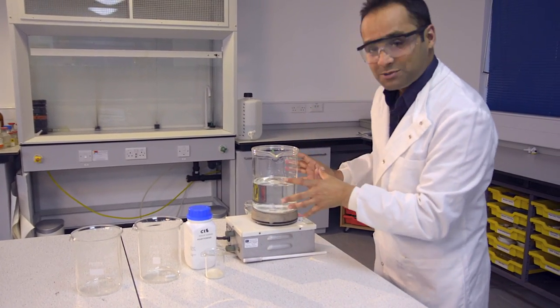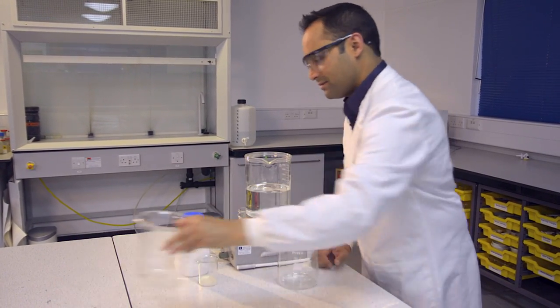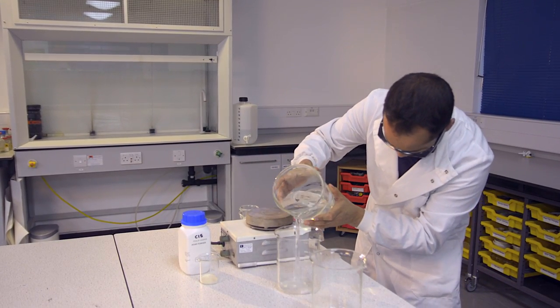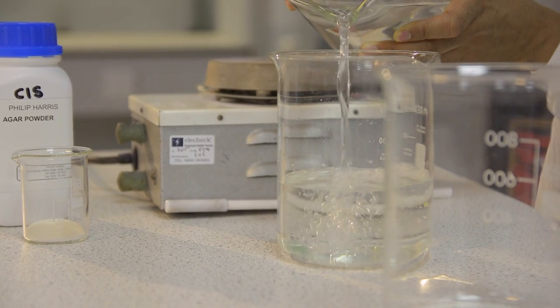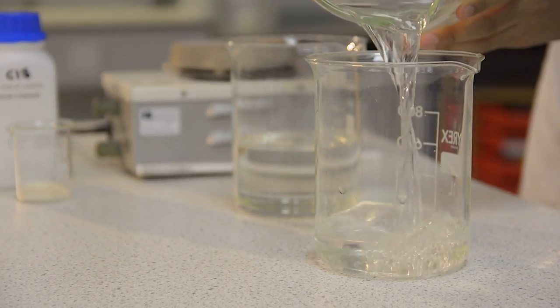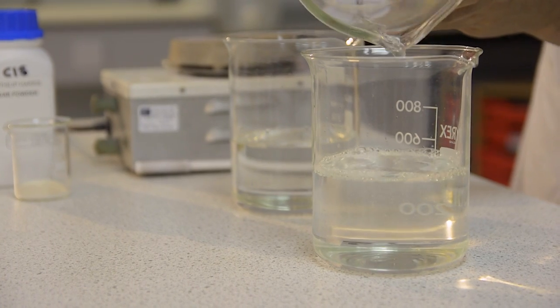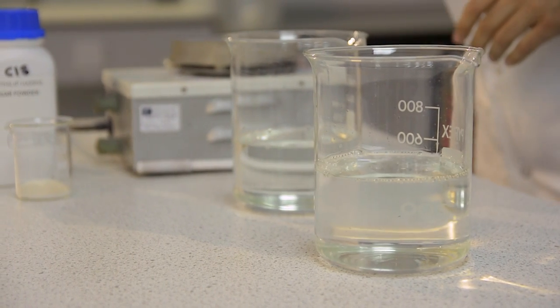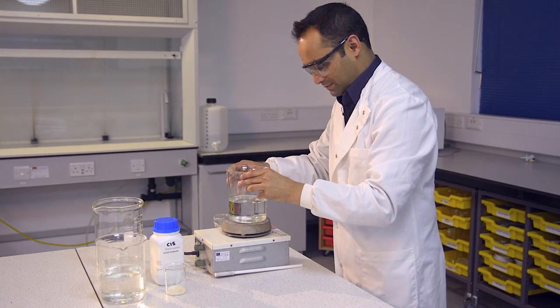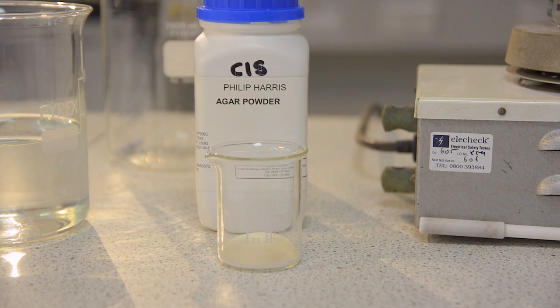I'm now going to split this quantity into two to make the next step easier. I'm going to add some agar powder to the solution, and you do this for each beaker.